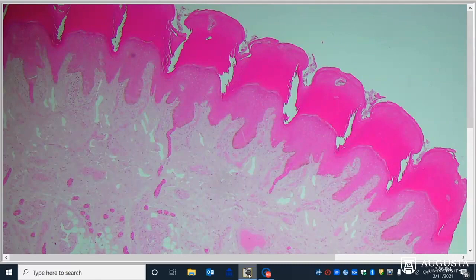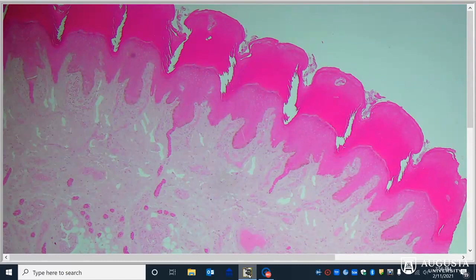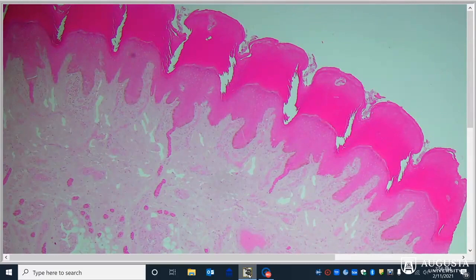This video is going to focus on palmar skin. The palms of your hands and the soles of your feet have a different type of skin than the rest of your body. We call it thick skin, and that's what we see on this slide and on the right hand portion of the model.